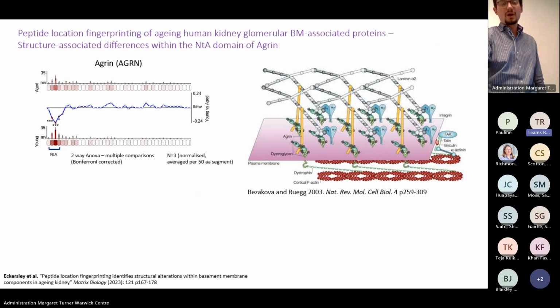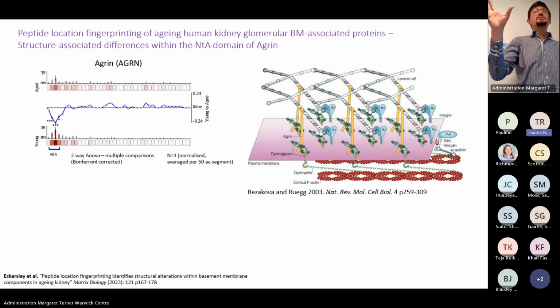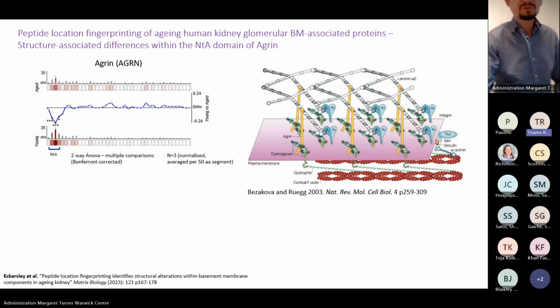And so right now it's clear that we can find differences, but we really want to know a bit more about the nature of the changes that are occurring. In addition to just probing the structure of proteins, we were also going to look for things like cleavage sites, things like endogenous peptides. We're really trying to build a picture as to what exactly is causing these regional changes.